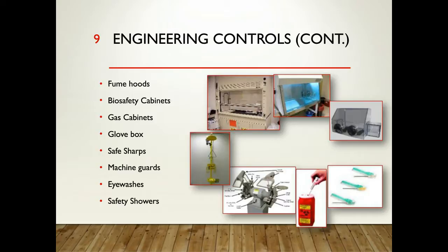What changes do you need to make to get the best and safest lab space you can? Eye washes should be plumbed to a sanitary sewer where they're allowable. That just eliminates the chance of having water damage, because you're going to get more damage in general from the water that spills on the floor during a safety shower use or an eye wash use than the minute amount of chemical that goes down the drain.